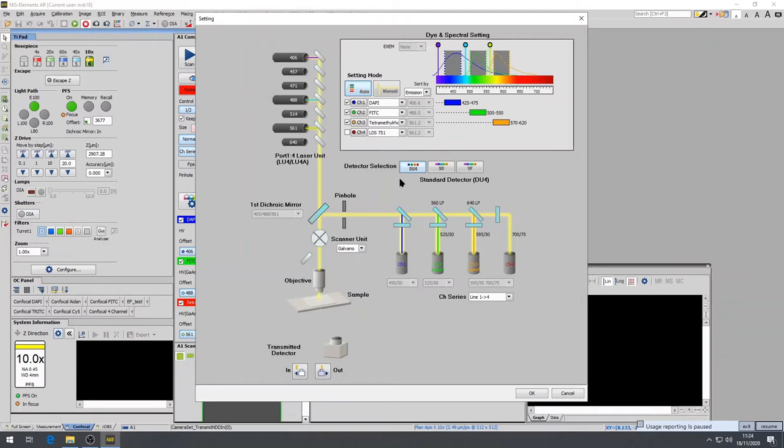The required lasers can also be selected up here. And the transmitted light detector, which is down here below, can be moved into or out of the light path.